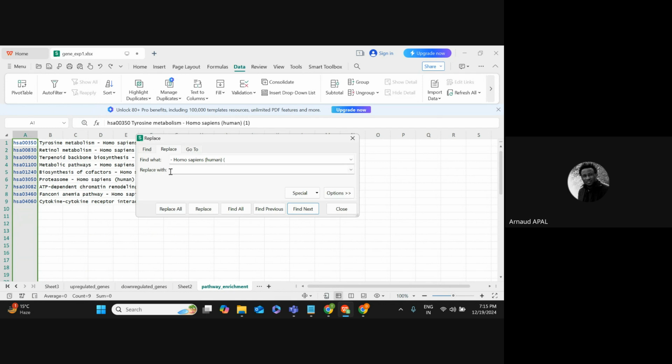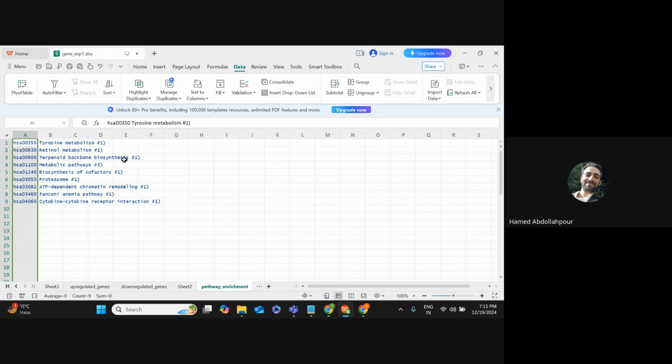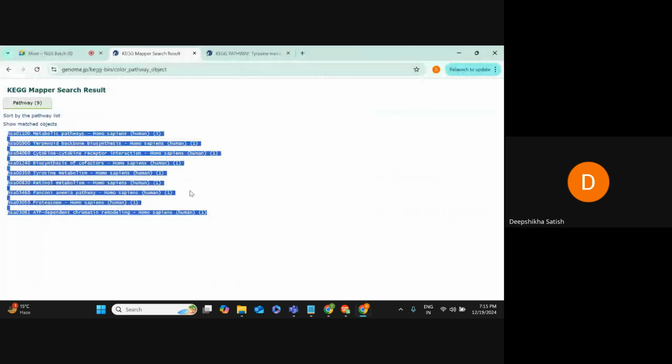What are we replacing? I don't understand why. This one, Paul. This is common, right? Human. Yes. Already we know this data has been taken from human only. So I am going to replace it with a hashtag, for example. Then you are removing it? Yes, yes. We are replacing with the hashtag. Can you see that? Okay. Because I already know this data has been taken from human. So two times it is telling you human, Homo sapiens. Can you see that? So I am just replacing with this hashtag.